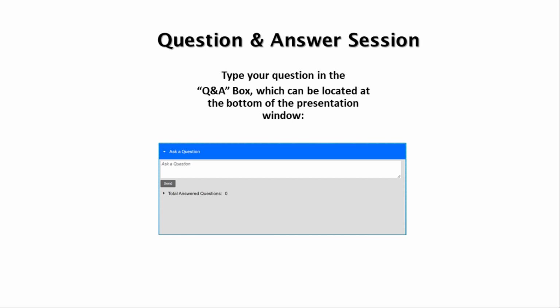So in general, I'd recommend starting out with a Halo 2.7 micron column, perhaps in either 4.6 or 2.1 millimeter ID by 100 millimeter length. And that really depends on your system configuration and what options you have available to you. But we are happy to help answer questions like this from customers.